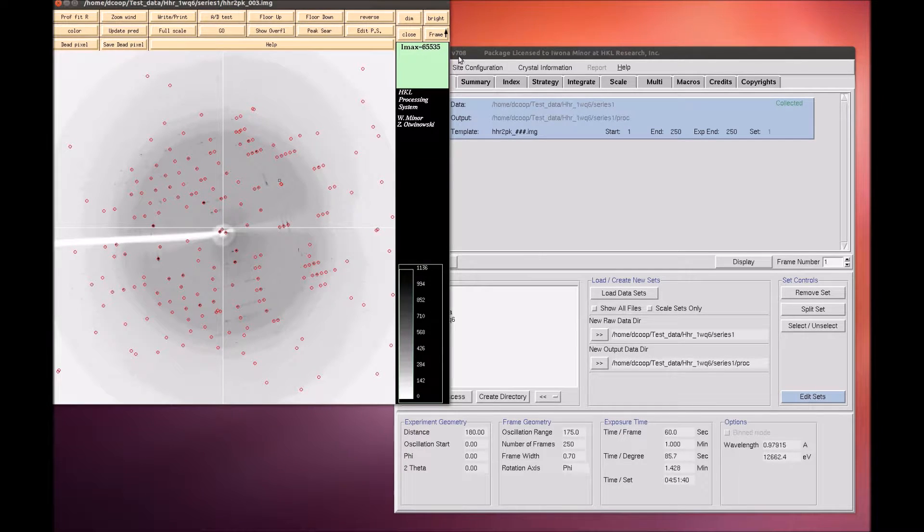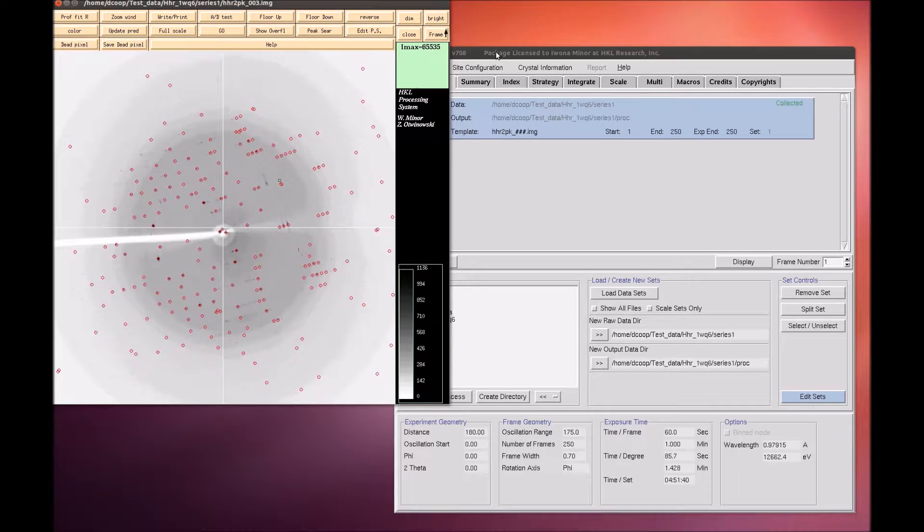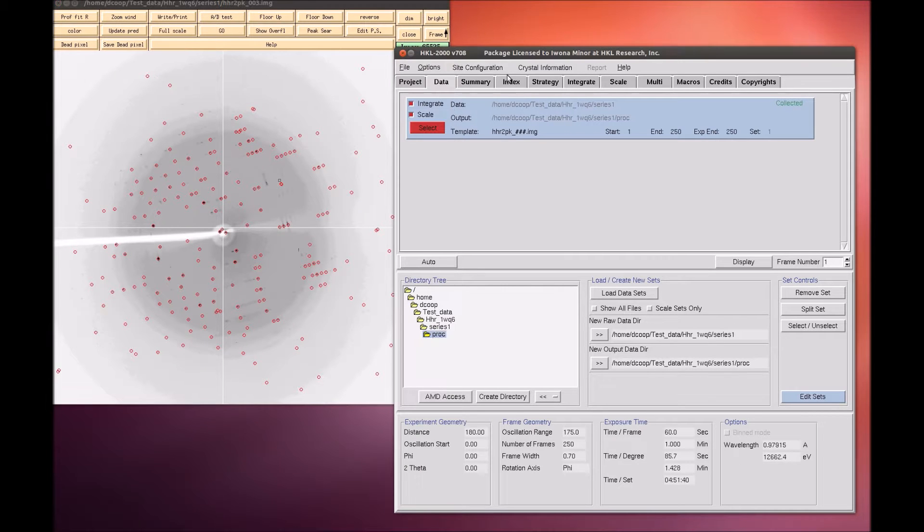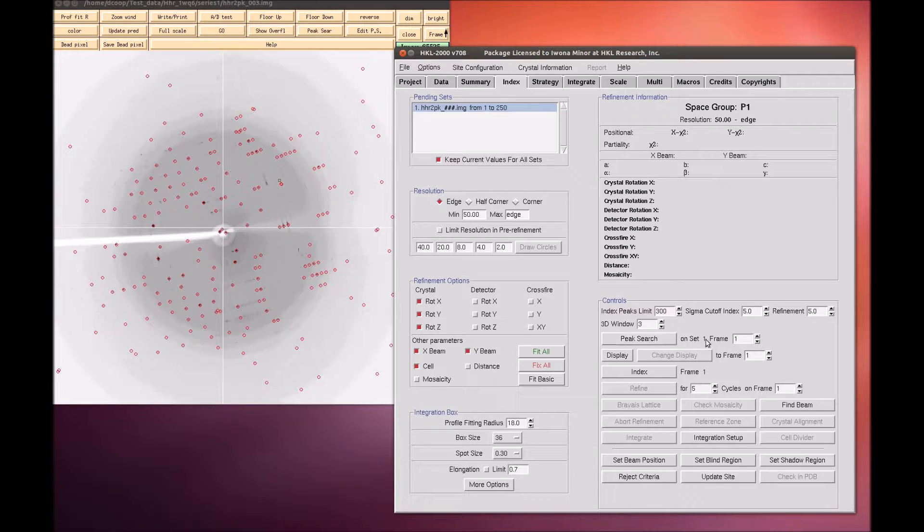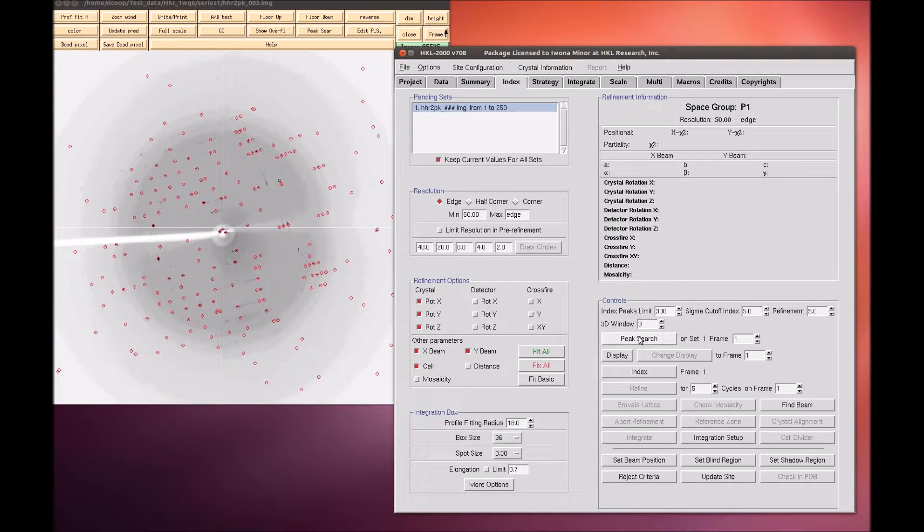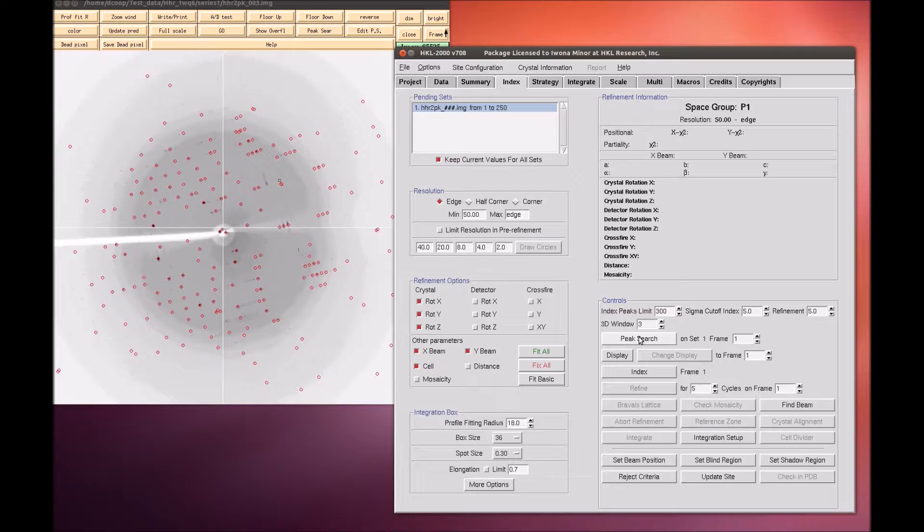Because the default parameters for peak selection are usually good enough, the alternate way of performing a peak search is to switch to the Index tab and select Peak Search. This will automatically select peaks from the first frame. It will also display the image if you have not previously done so.